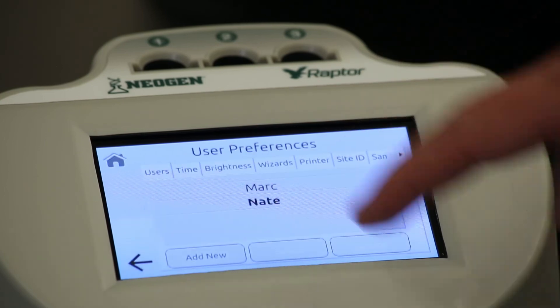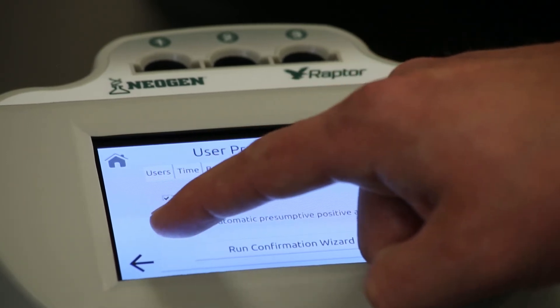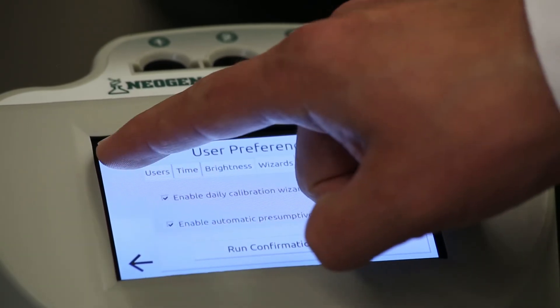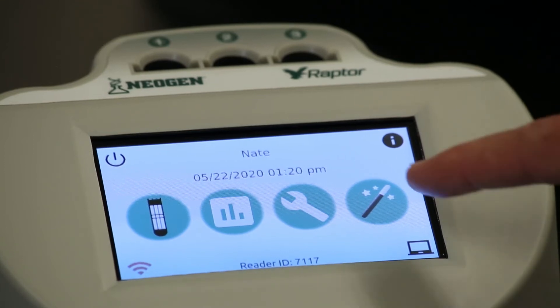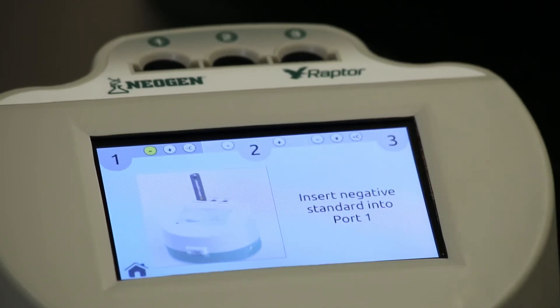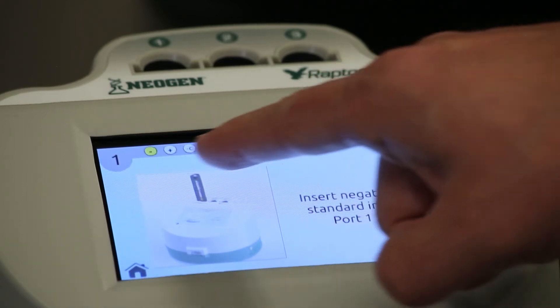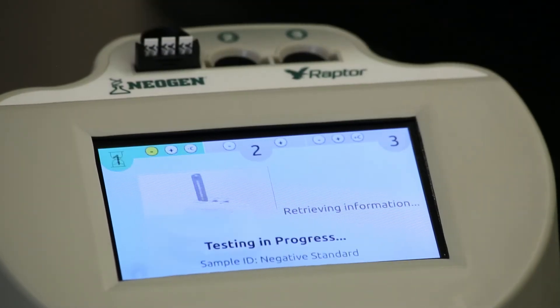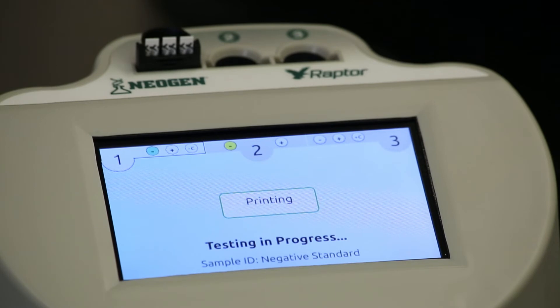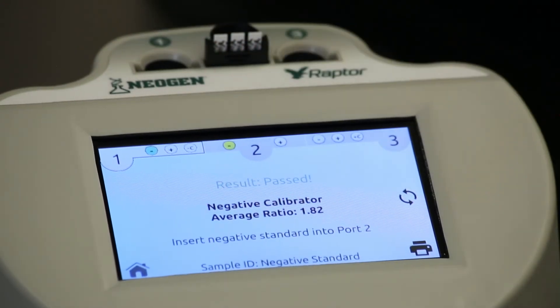To enable the daily calibration wizard, select user preferences and navigate to the wizards tab. Select both the daily calibration wizard and presumptive positive wizard, then return to the home screen. A fourth main icon depicting a magic wand will now appear. Select the wizard icon to begin the daily calibration test routine. There are on-screen prompts indicating the next step, along with icons above: yellow indicates which step you are on, and green represents steps completed. Begin by inserting the negative reader calibrator in the first port. The reader automatically recognizes and analyzes the calibrator, then prompts the user to move to the next step. Continue following the on-screen prompts until the reader calibrator section is complete.